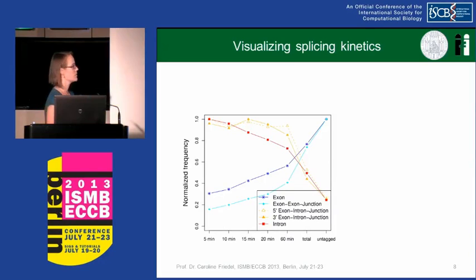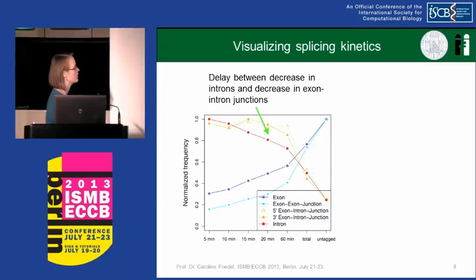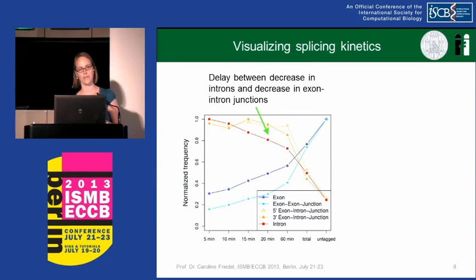So what we also did is, because before we could not really see these junction reads because the relative contribution was so little, we normalized the frequencies to the maximum frequency in any sample, so that we compare the change in intronic reads and exon-intron junctions, or on the other hand, the exonic reads and the exon-exon junctions. And what you see here is something which at first made our biologists very excited, because there seemed to be a delay between the decrease in introns and the decrease in exon-intron junctions. So it appeared that the introns were already decayed while the exon-intron junctions were not yet spliced.